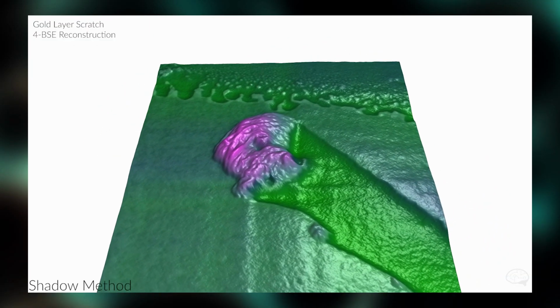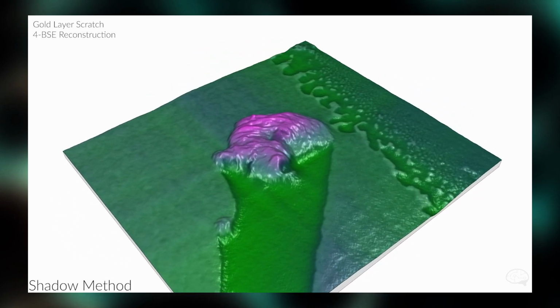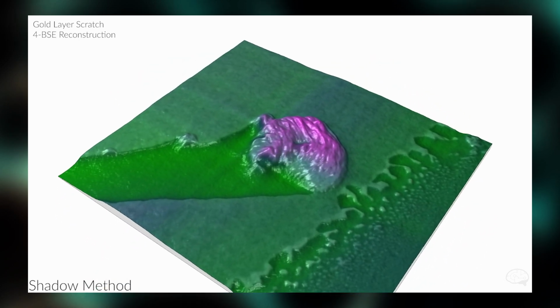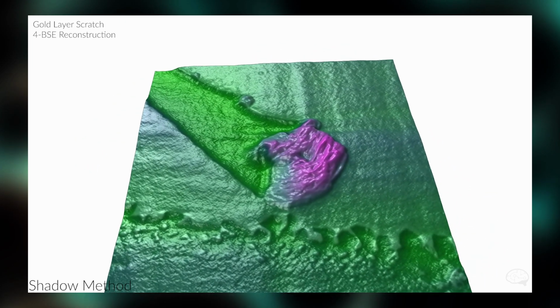Besides that, the calibration, if you're doing it right, I found to make very accurate data that was more in the range of plus or minus 5% error. Now, that is just anecdotal and could vary based on which software and which microscope you're using, but that is what I have seen personally.